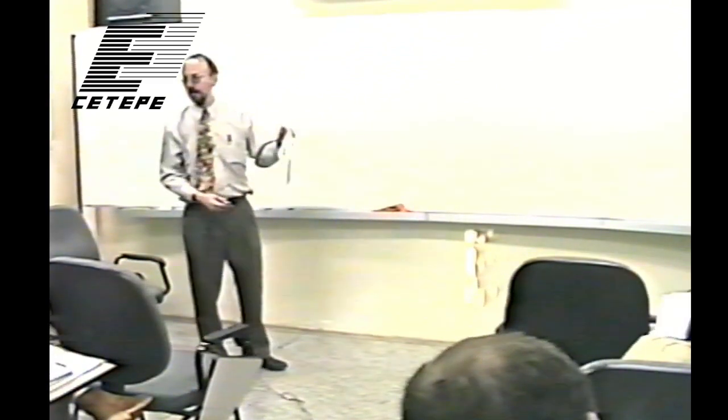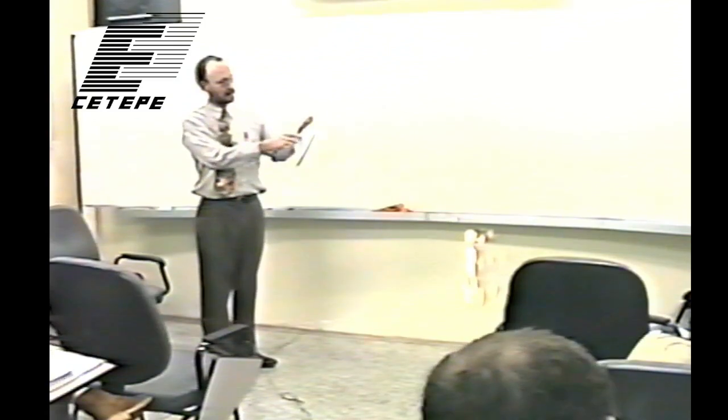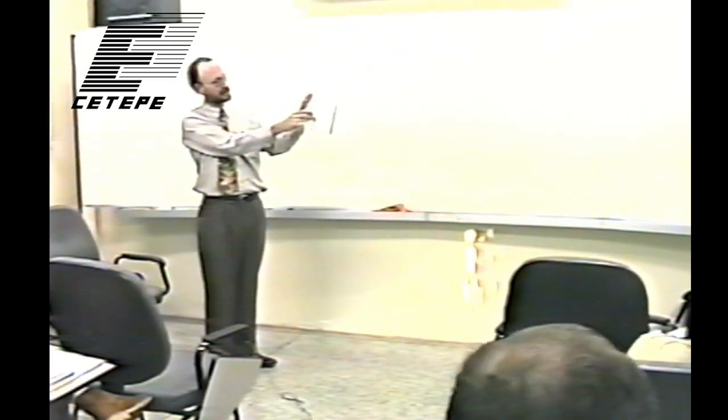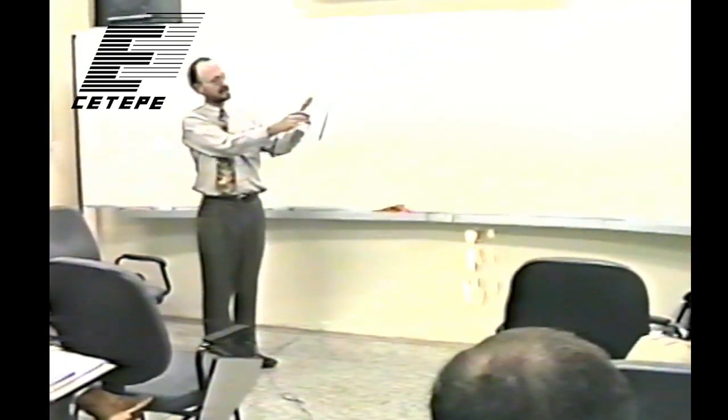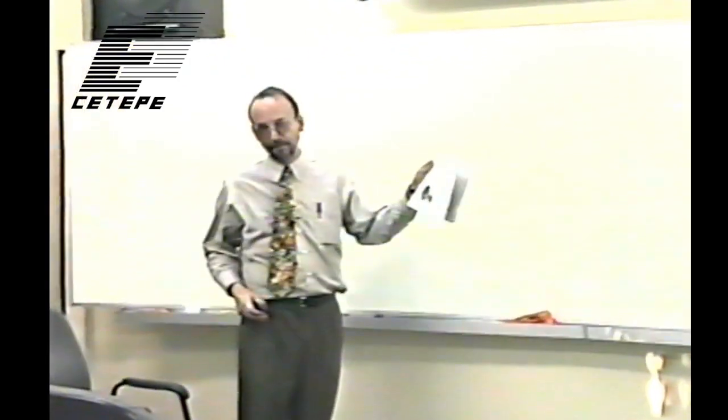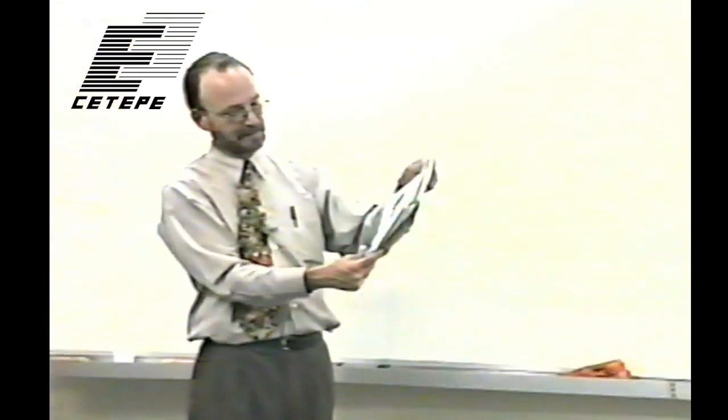Then the next chapter that I have some excerpts from is influences on image quality. And there's some very nice diagrams that we'll try to address a little bit more, where they take the form of these kind of charts where you have image clarity in the middle. And then these boxes, or these ovals with the arrows pointing in, are the major determinants of image quality. So contrast and unsharpness, which we talked about, distortion and artifacts and noise. These are all things that we'll be addressing a little bit this week.